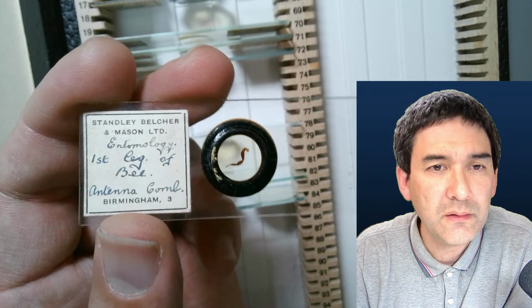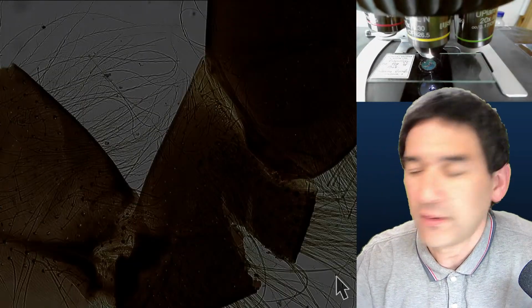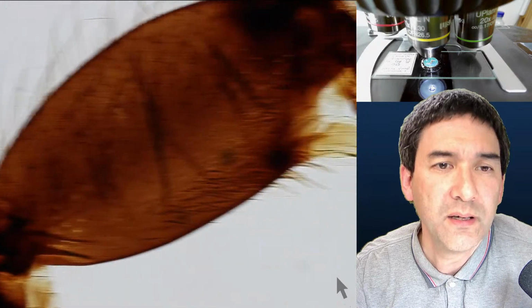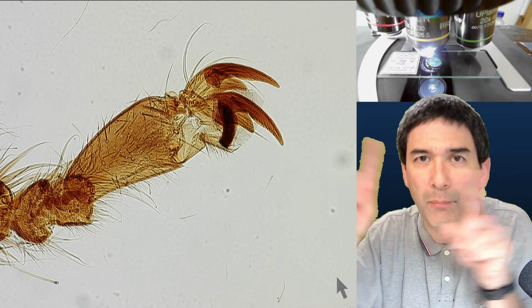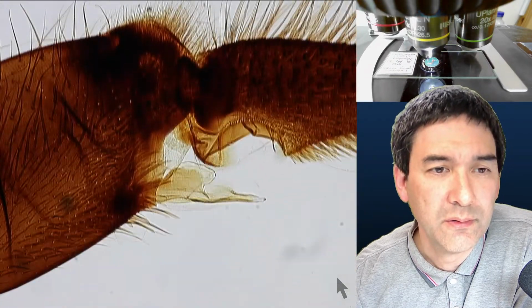As you see, what I have done here is I also made a video of this, but not in a square; I simply went along the leg of the bee. For example, I started here and then I made a video by moving up like this, and then across like this. So it's not in a box, but kind of traveling in one direction. So that's the way it looks. Looks also quite fascinating, I think.